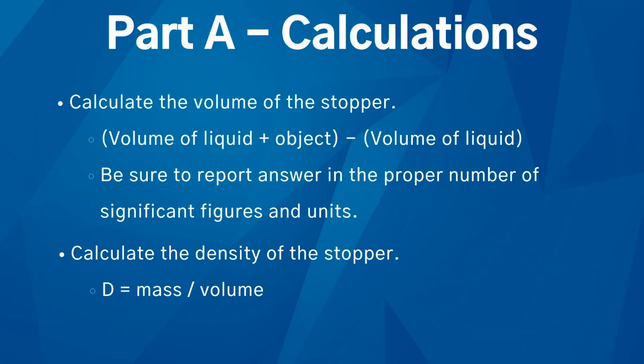With these measurements, you can now complete all of Part A for both objects, stopper and metal rod.